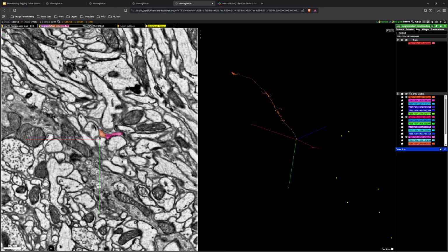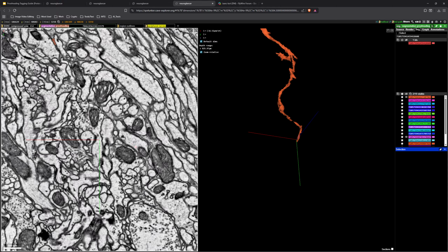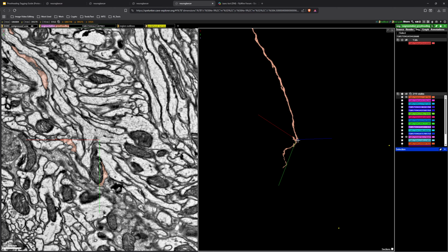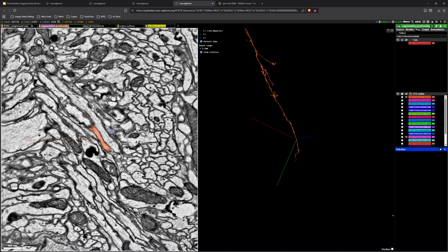But if you were scrolling quickly, you could definitely miss this. And if you were just looking at it like this, you'd be like, okay, well, is it over here? Well, it's not really over there, but it doesn't look like it should end here. So just use your gut and say, okay, what else is happening around?